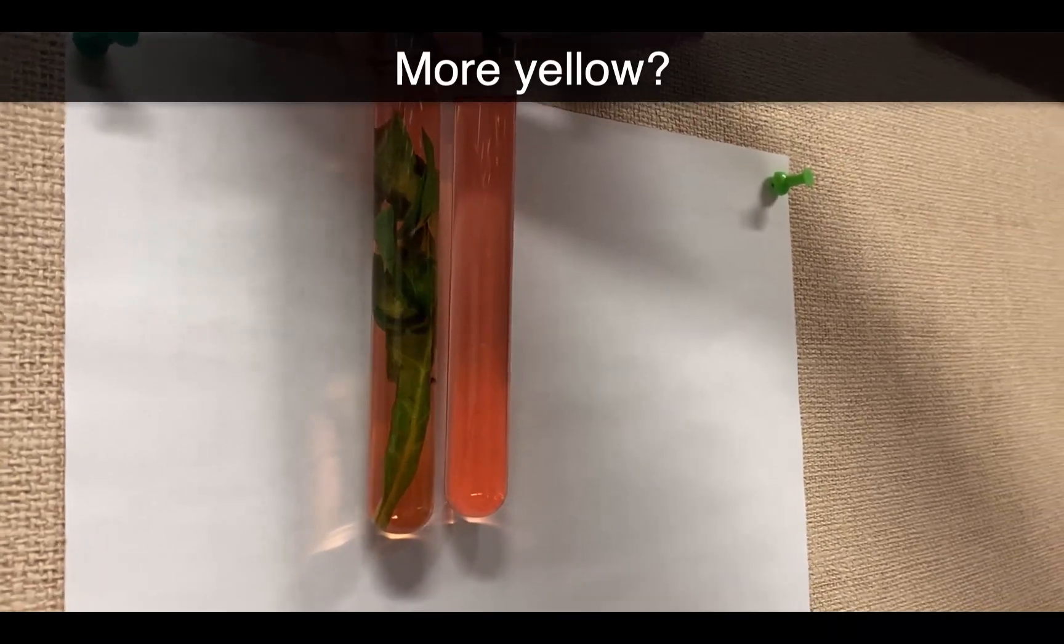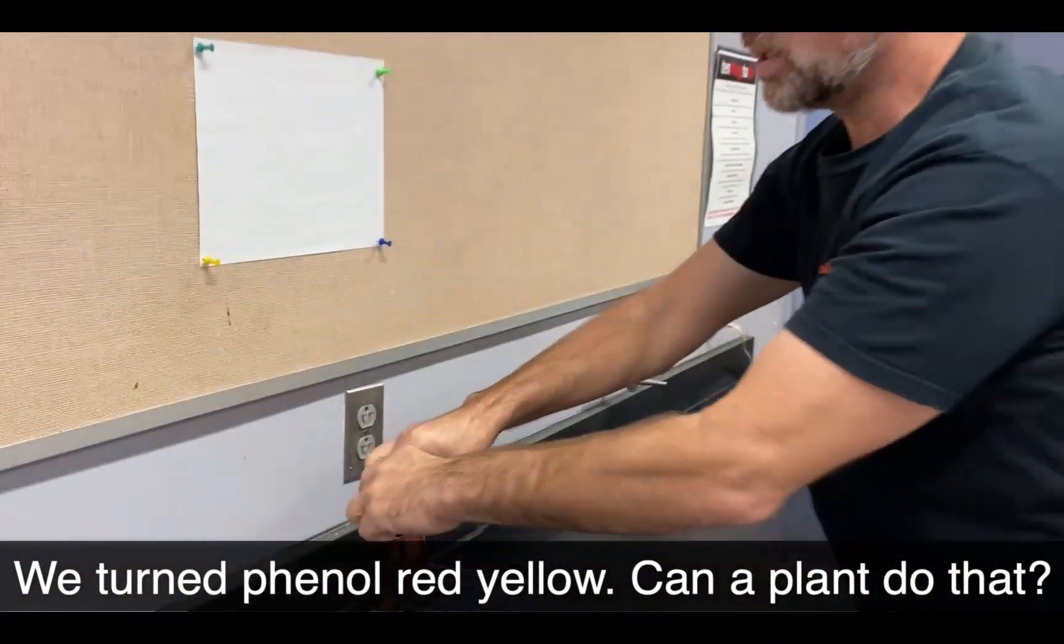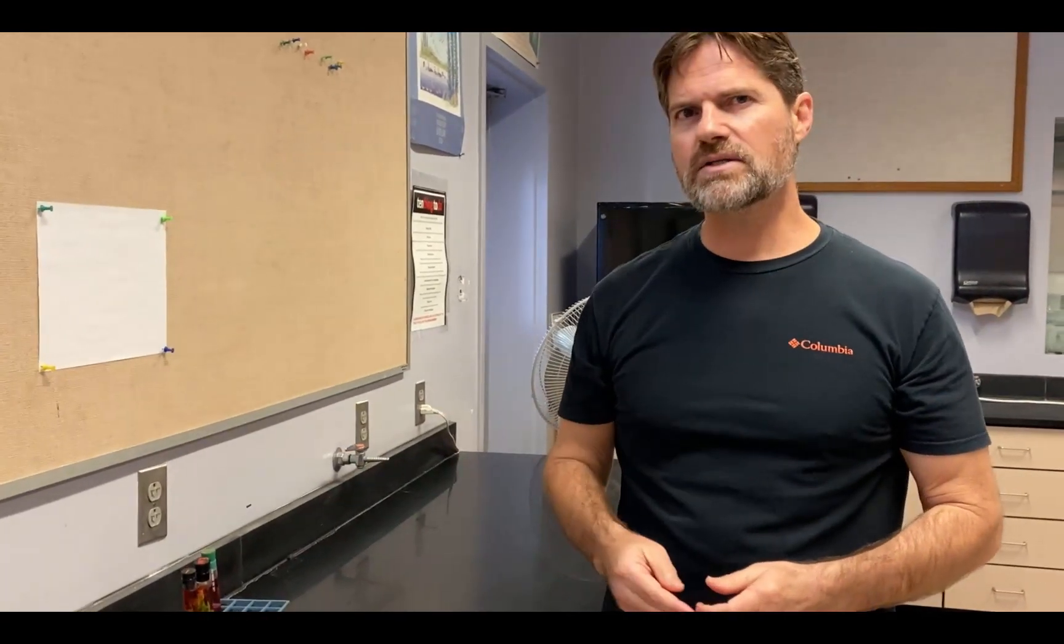That's an interesting result. Tube number two was out in the sun with all the other tubes, but it was inside a photoblocker so it wasn't able to receive the light energy that fuels photosynthesis. Yet we saw it turn yellow.